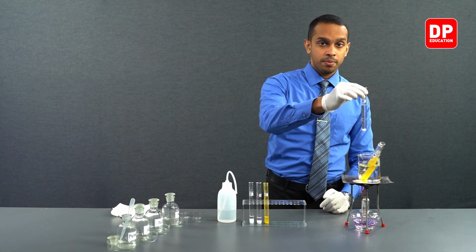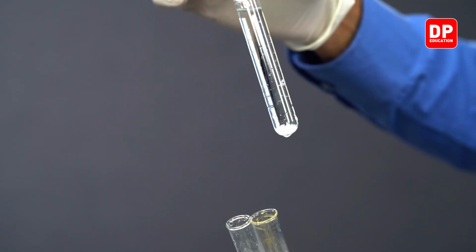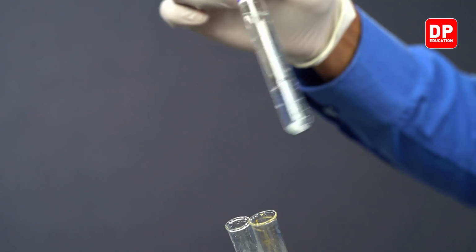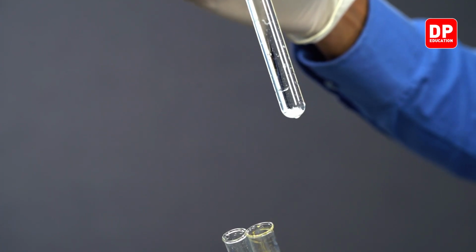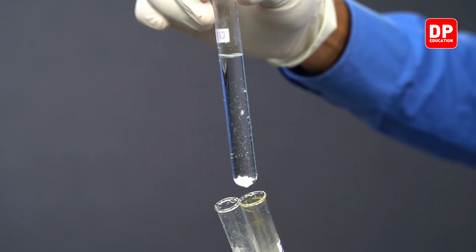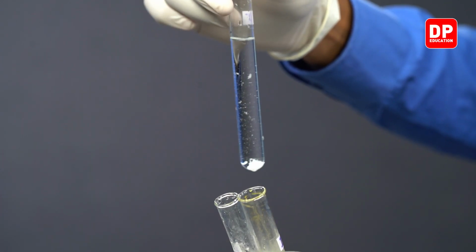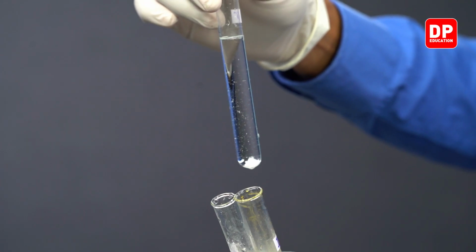Now students, please observe how some of the precipitate that we initially had has started to dissolve when we were heating this test tube up. When the test tube was heated, some of the precipitate started to dissolve in that hot water.